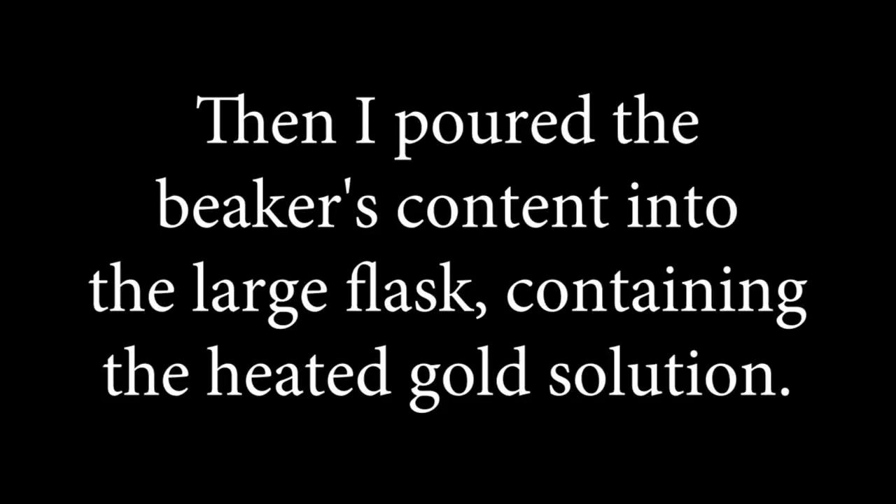Then I poured the beaker's content into the large flask containing the heated gold solution.